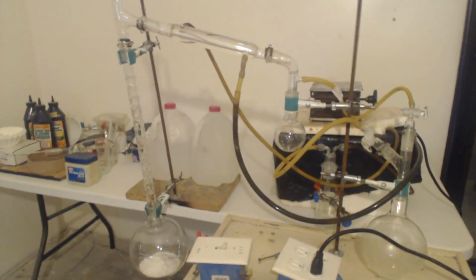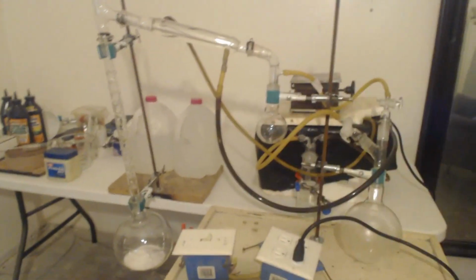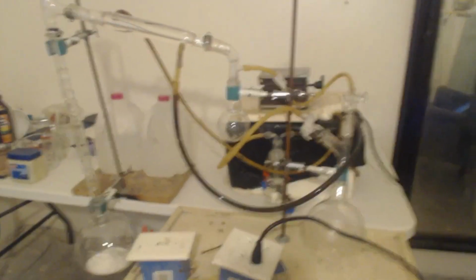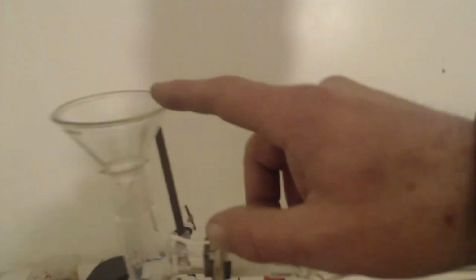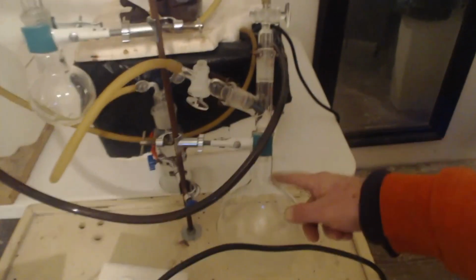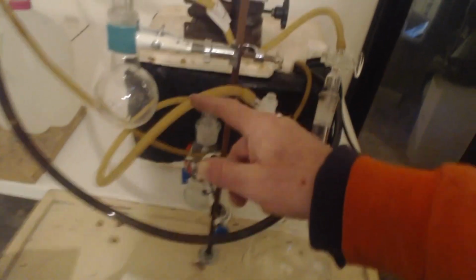Alright, there's my apparatus. You see over there I got the potassium nitrate, a Vigreux column. The only reason I have a Vigreux column is that we've got to get better separation. Right now I have a funnel up here because I still have to add the sulfuric acid. That's how I'm going to add it. I got a little tiny condenser, comes down here to the receiving flask. And you can see this hose comes down to here and into this little round bottom flask thingy. That's a suck back trap. And it goes around to the back there. I don't know if you can see that.